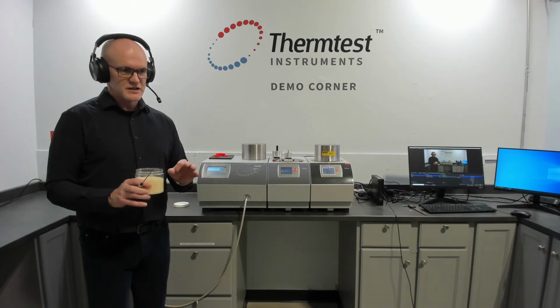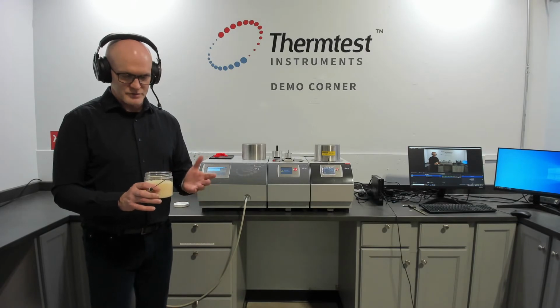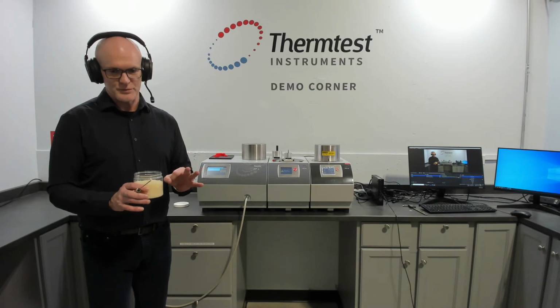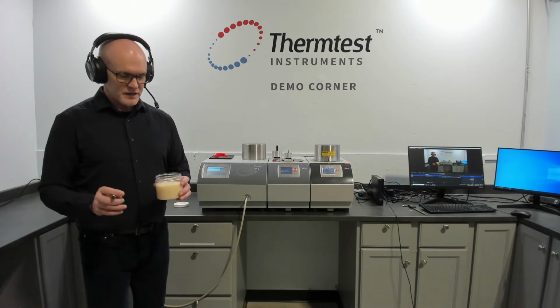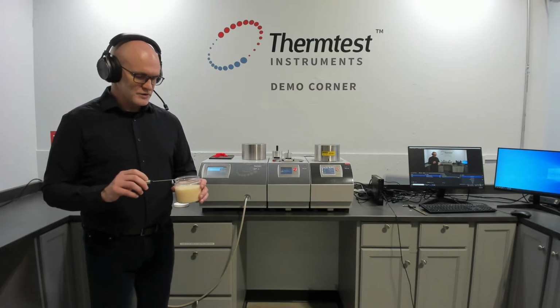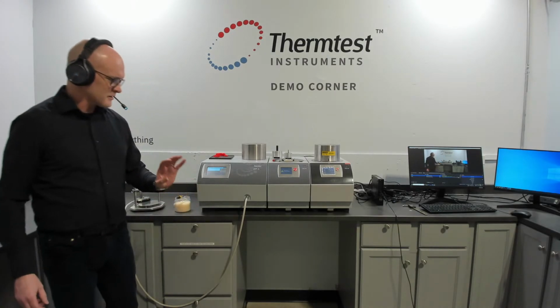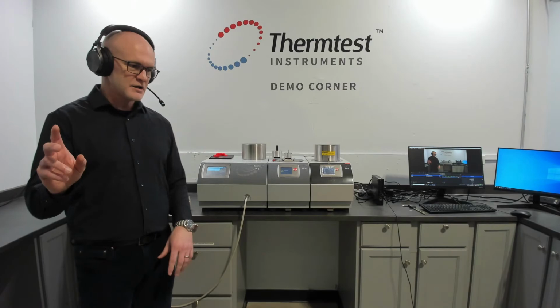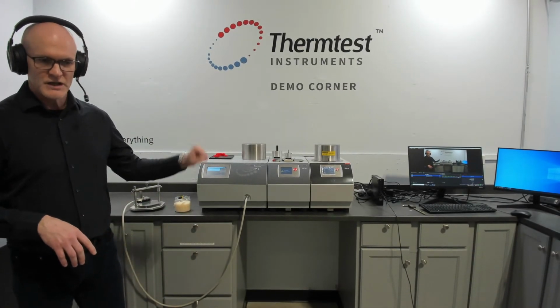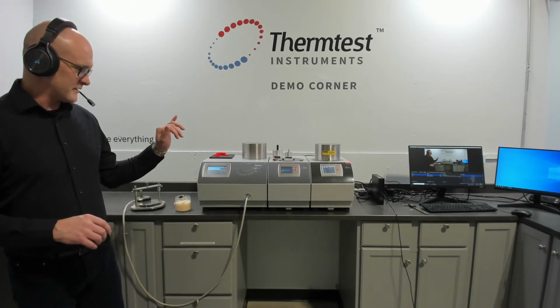So we've addressed solving 3 main problems that we were asked to look at, as well as adding value in that we get 3 properties. Those 3 properties can be quite critical for inputs into thermal simulation software. We'll show some sample setup with the cell. The samples we'll be setting up will be polycarbonate, and then we'll move over to the temperature platform and show you how those work together to develop easy setup and testing with temperature.